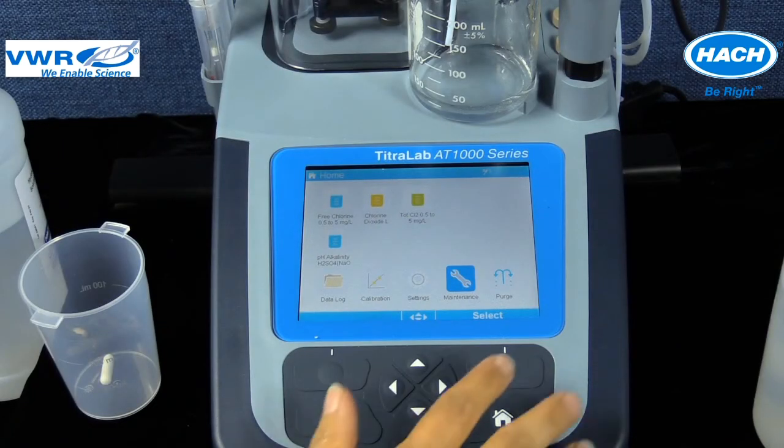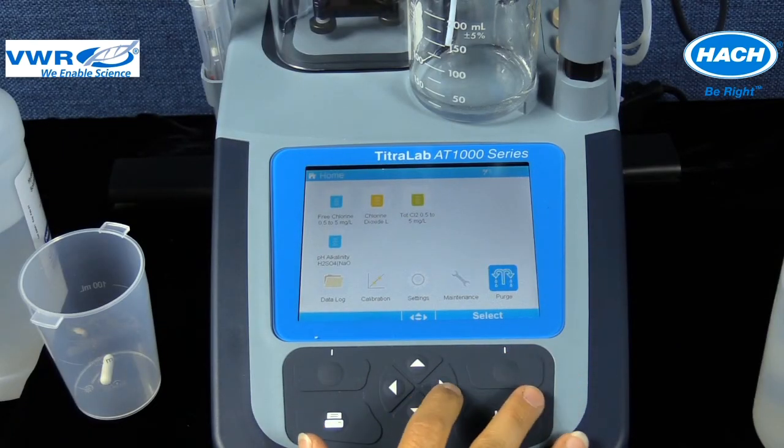It is recommended to purge the tubing from the syringe at the start of each day's titration. This purge procedure clears air bubbles from the tubing and syringe and replaces old solution with fresh solution.